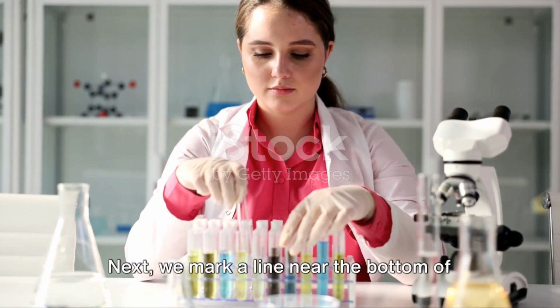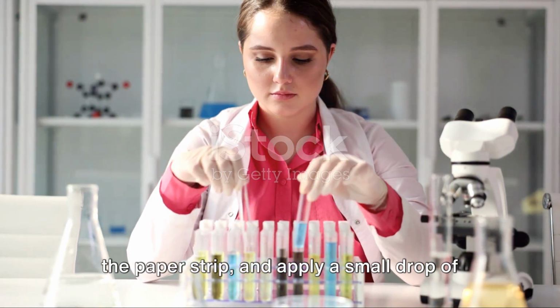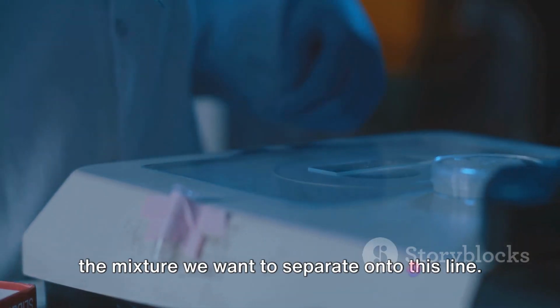Next, we mark a line near the bottom of the paper strip and apply a small drop of the mixture we want to separate onto this line.